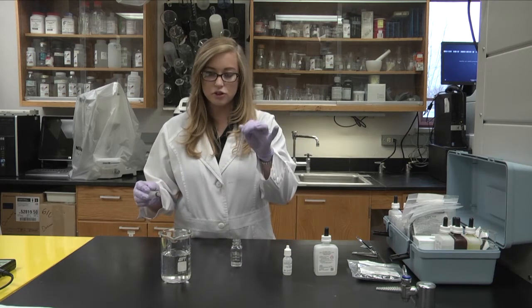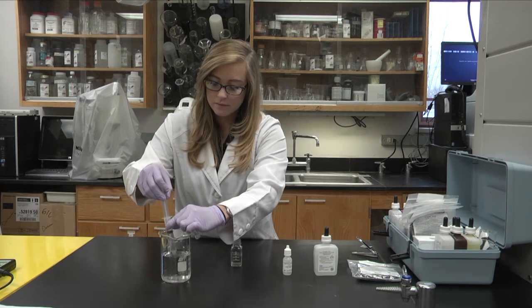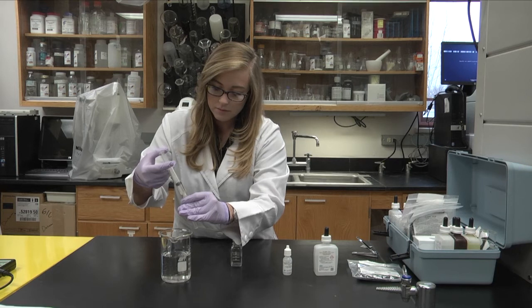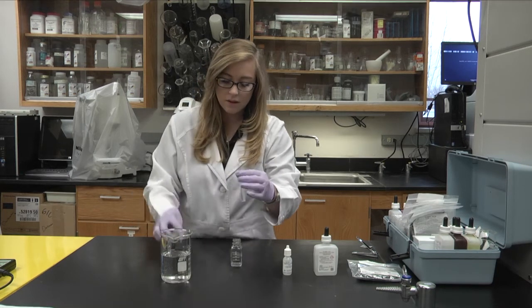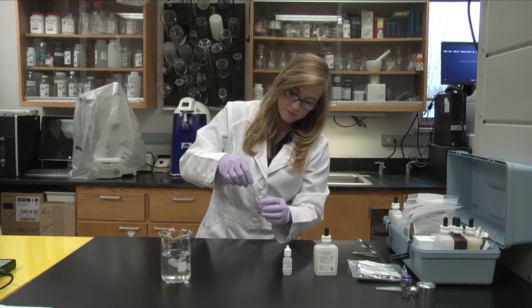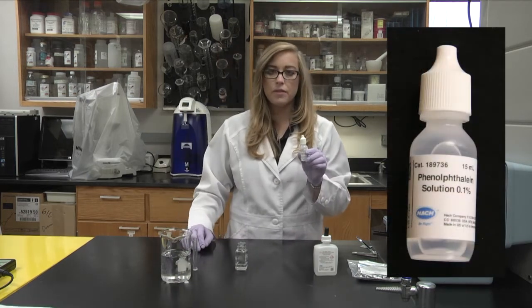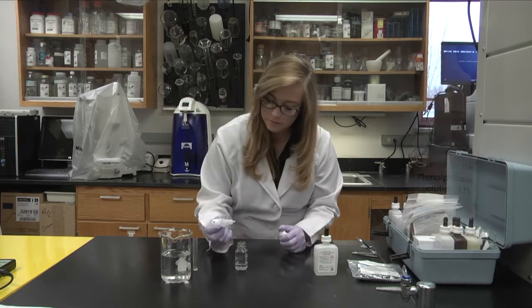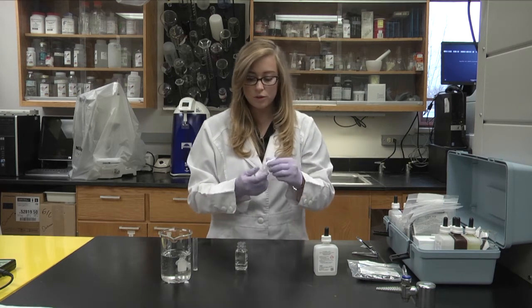First, you're going to get your plastic tube and fill it up, then pour it into your glass mixing bottle. Then you add one drop of the phenolphthalein solution and swirl to mix.